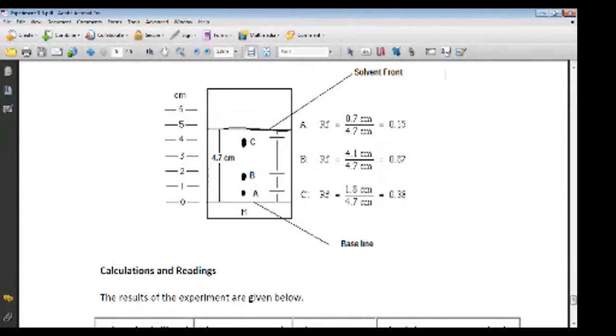You will get a first spot, second spot, and third spot — this ink is actually a composition of three different colors. The solvent moves upward from the baseline carrying the three different components. The total distance traveled by the solvent alone is called the solvent front — here it is indicated as 4.7 centimeters. The first component, a, travels 0.7 centimeters from the baseline, so its Rf value is 0.7 divided by 4.7.